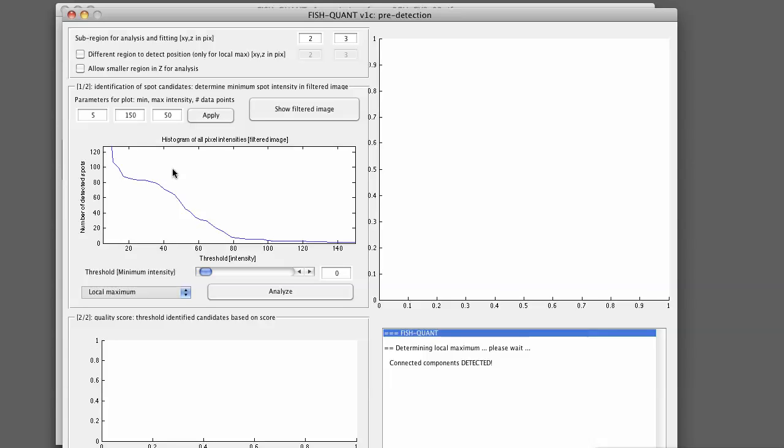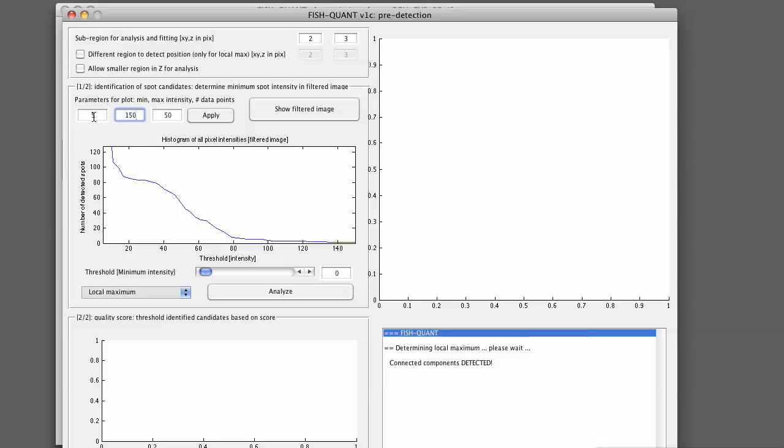This plot can also be recalculated for a different intensity range. It works well for our images, but it could be that your images are much brighter. So you can define here the minimum intensity, which was 5, the maximum, which was 150, and the number of points on this histogram. You can set this, just to show you how it works, to 1500.